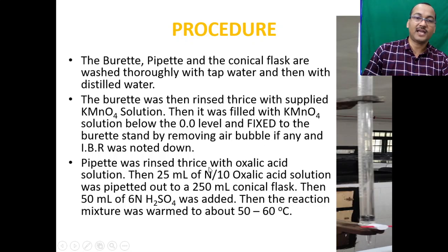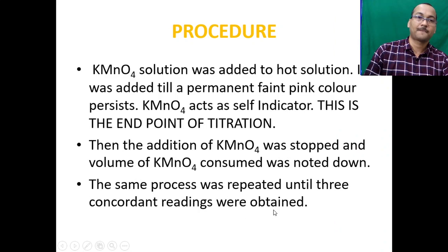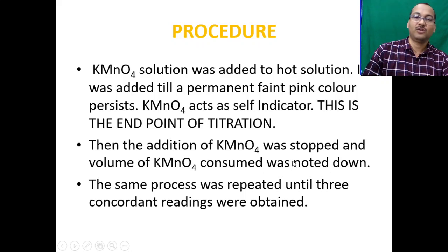Rinse the pipette thrice with oxalic acid solution and pipette out 25 mL of N/10 oxalic acid into a 250 mL conical flask. Add 50 mL of 6 N sulfuric acid, then warm the reaction mixture to about 50–60°C. Add KMnO₄ solution from the burette to the hot solution until a permanent faint pink color persists — this is the end point. Note the final burette reading; the difference gives the volume of KMnO₄ consumed.